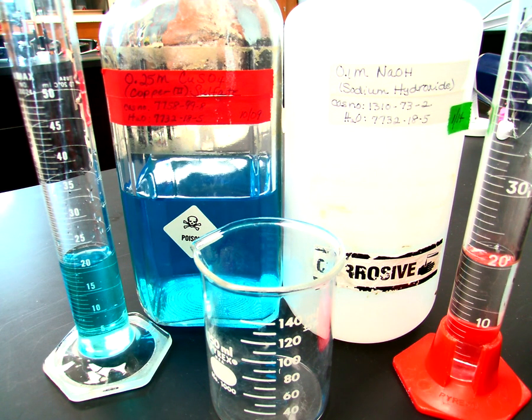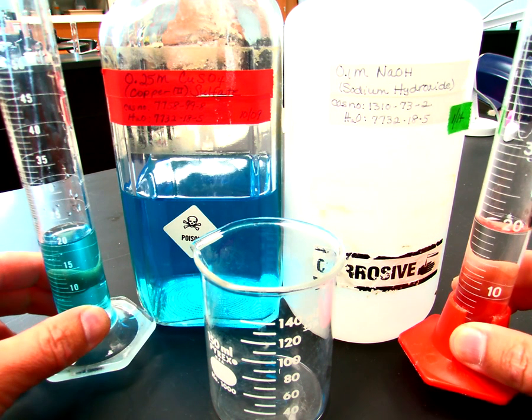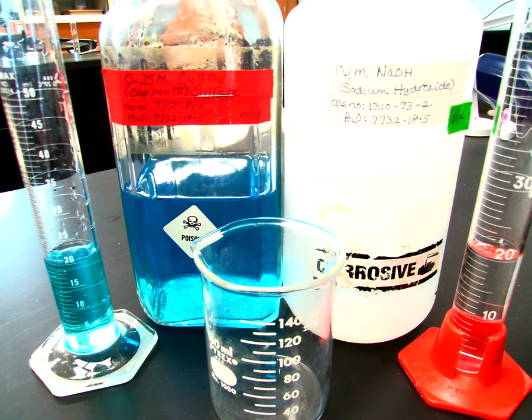You're going to have a set amount of each of these solutions that you're going to decide how much of each you're going to use. And the whole point of this is to find the percent yield of the precipitate.